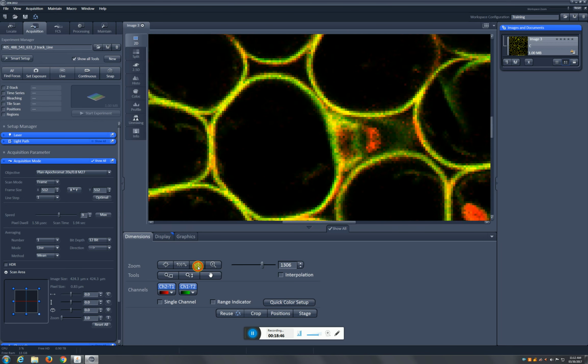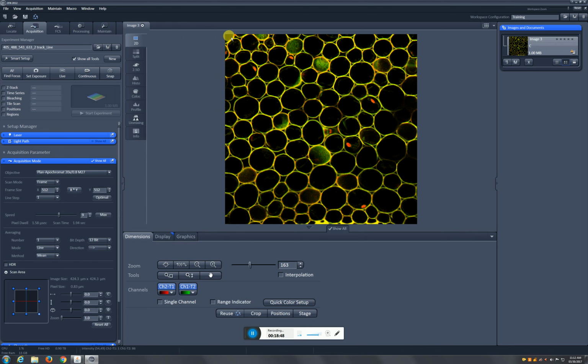So what happens is that the laser will run across the image, starting at the top, coming back, and just do this iteratively until it's able to acquire the entire image. So by having more pixels in our scan process, we lengthen the total scan time, and that's represented here under the speed option. So scan time for this setting is approximately 2 seconds.